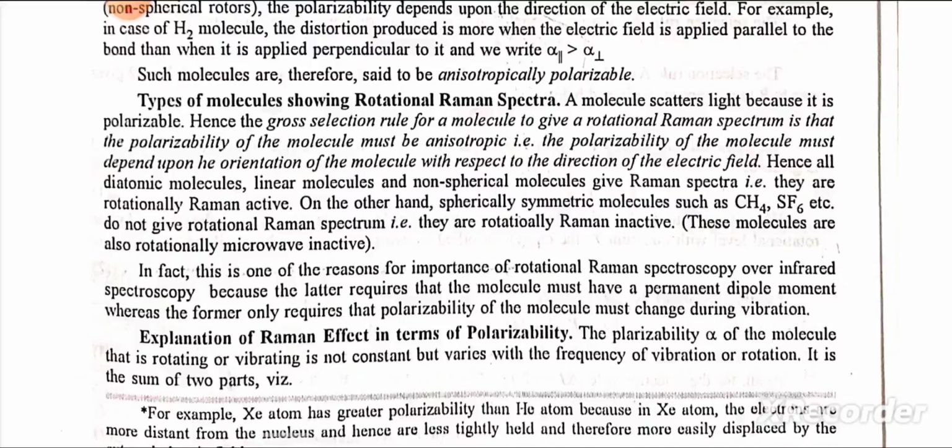On the other hand, spherically symmetric molecules such as CH4, SF6, etc. do not give a rotational Raman spectrum, that is, they are rotationally Raman inactive. These molecules are also rotationally microwave inactive. In fact, this is one of the reasons for the importance of Raman spectroscopy over infrared spectroscopy, because the latter requires that the molecule must have a permanent dipole moment, whereas the former only requires that the polarizability of the molecule must change during vibration.